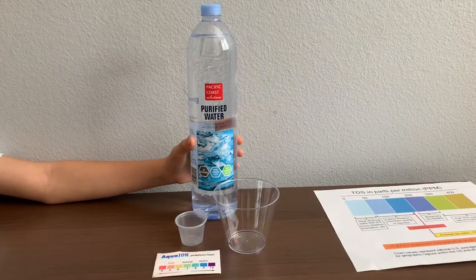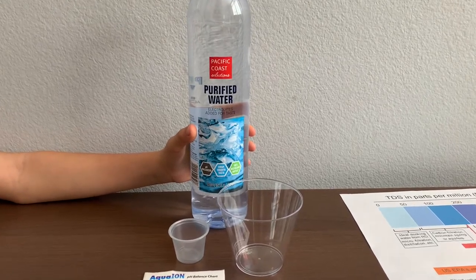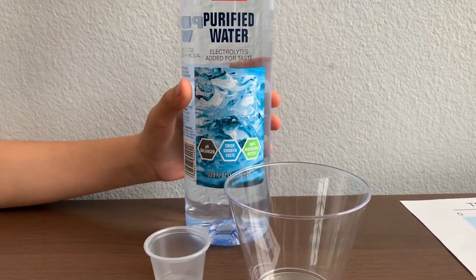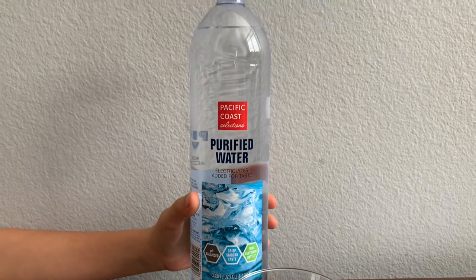This is Pacific Coast Purified Water with electrolytes added for taste. It is purified by reverse osmosis. The pH balance is supposed to be 6 to 8. It is sold at Lucky Market in San Francisco and it costs $1.29.